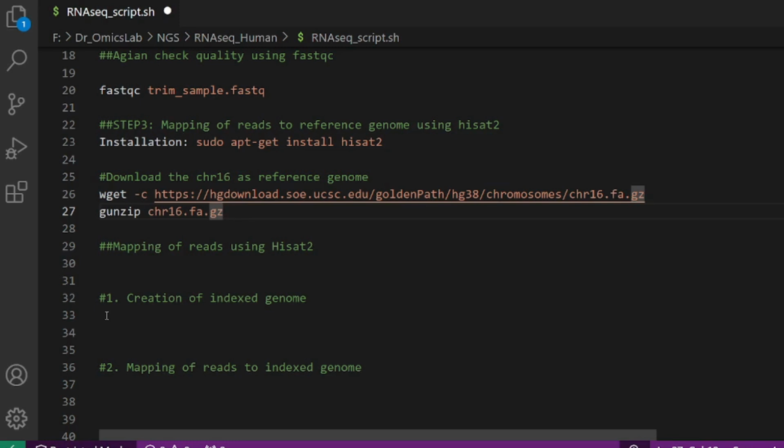The same logic applies here: when you divide the reference genome into small binary fragments, the tool can understand them easily, and because of the short fragments it is easy for the tool to search a specific location. This increases the speed of mapping.